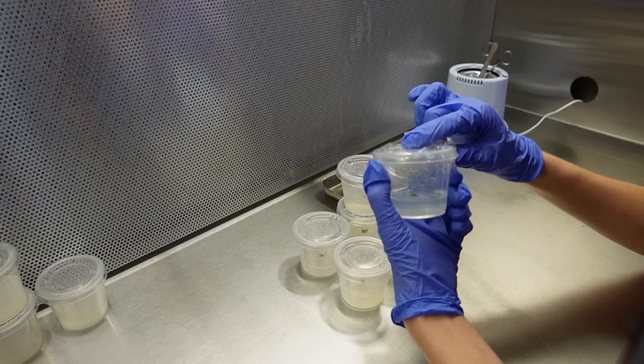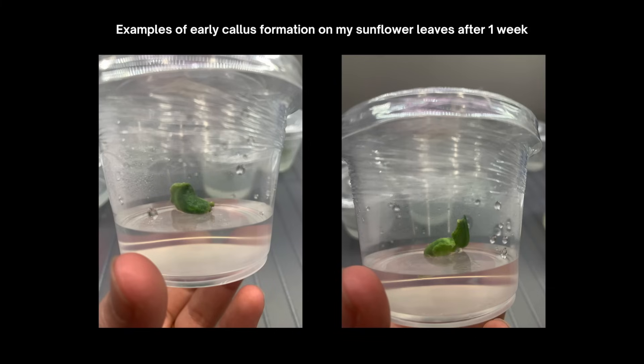After a few weeks, we should start to see some callus growth on these samples and from the callus, you will see young baby plants start to form and grow. You can keep subculturing the callus over and over to make more and more plants, and that's how you would potentially end up with 100 or even a thousand plants from one seed.